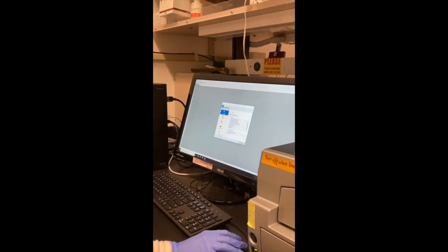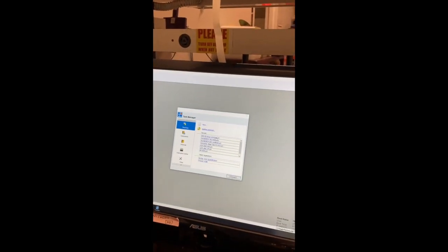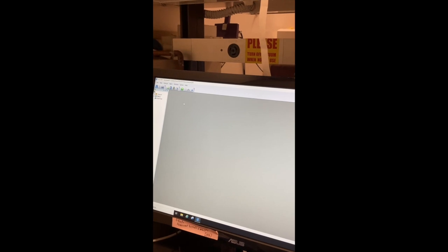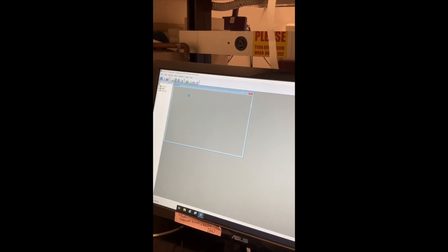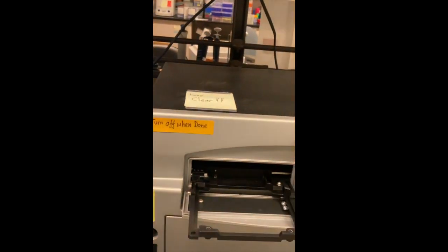And you can click on my BCA KV linear protocol, and that will bring you to the setup. It's loading. You always want to click COM4. Let it load. And this is normal, it does its own setup thing.